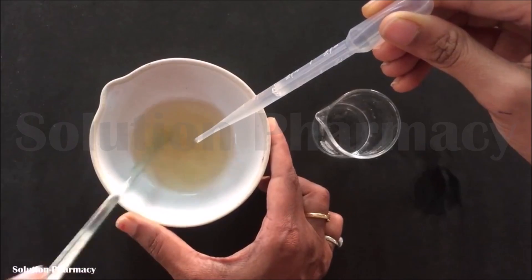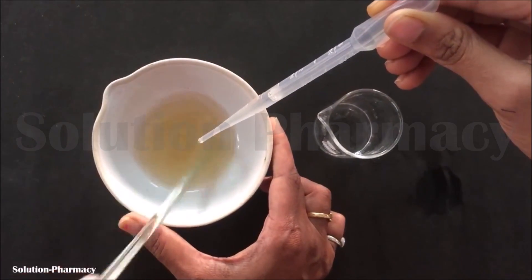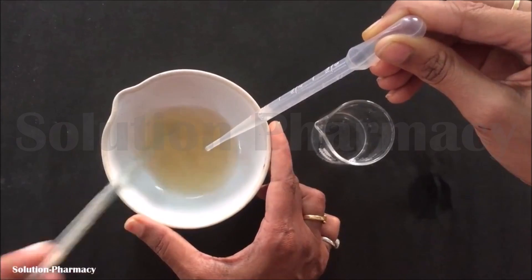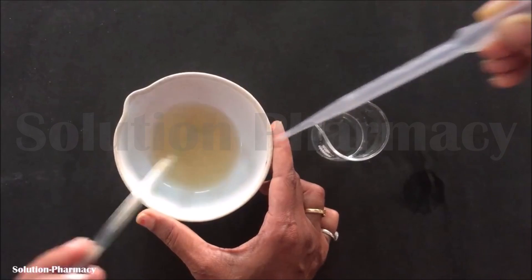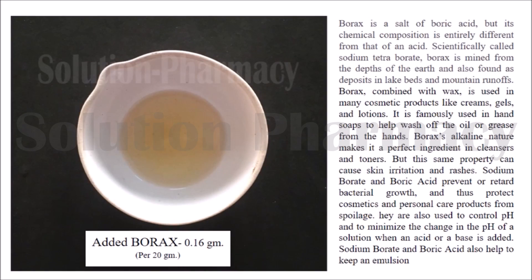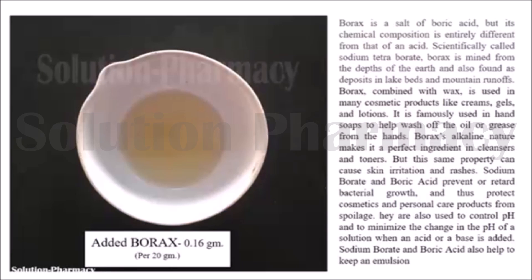Now with the help of a dropper, add the borax solution drop by drop into the china dish containing the liquid mixture of beeswax and liquid paraffin, and continuously stir the contents with a glass rod. Borax is basically the salt of boric acid. This boric acid reacts with the free acid of beeswax and acts as an emulsifying agent. Emulsifying agents are those agents which make water and oil miscible.